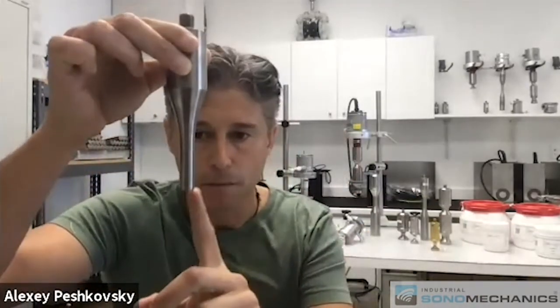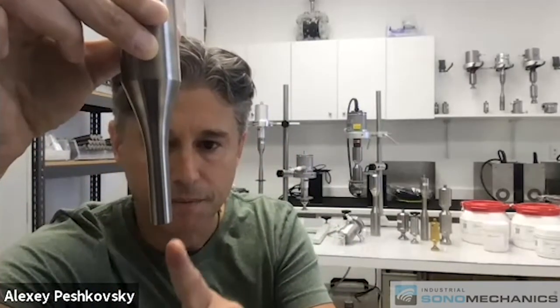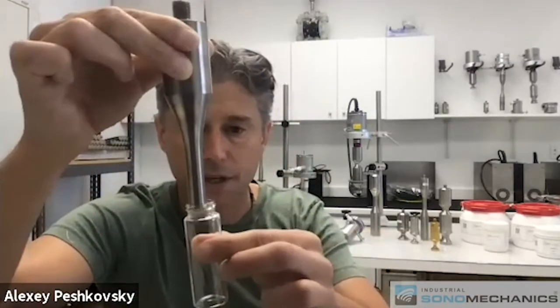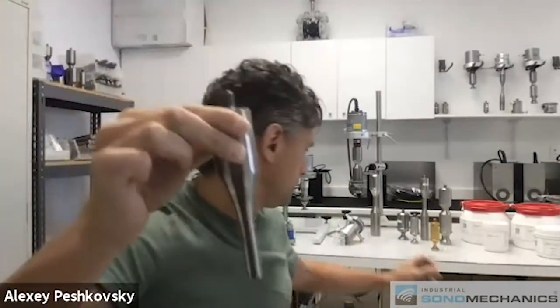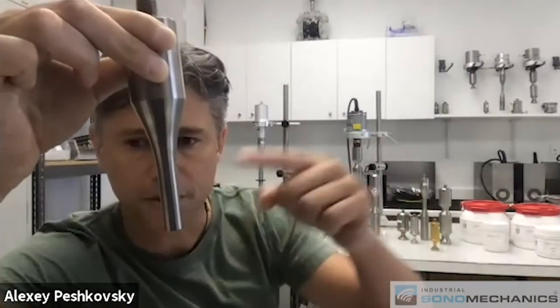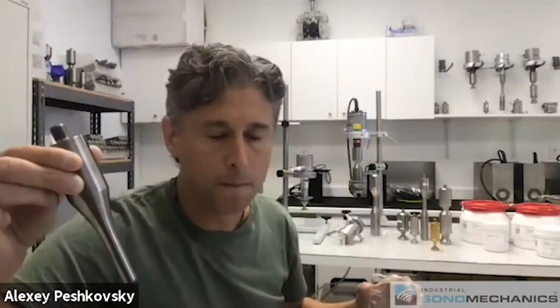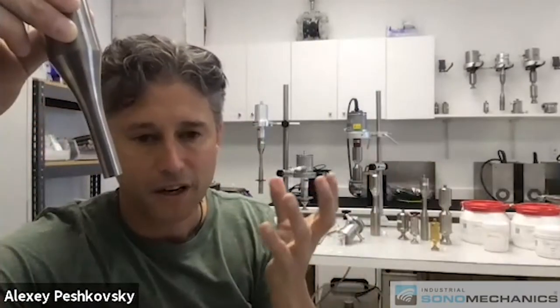Because this tip is small, and because the effect that it produces is kind of restricted to this area, there's a cavitation cloud that forms under it — this is the part that's doing all the work. If you do it in a little vial like this, then all of the liquid gets exposed because it mixes itself as the process happens through acoustic streaming. But a beaker like this is not going to work. It's too much to expect a little tip like this to homogeneously process that large amount of liquid.